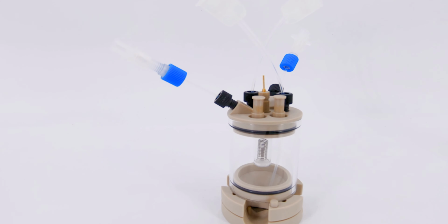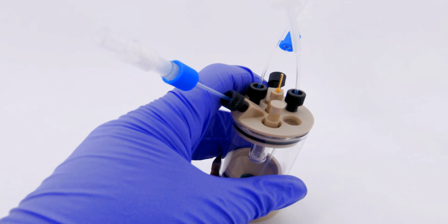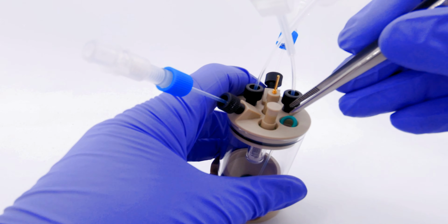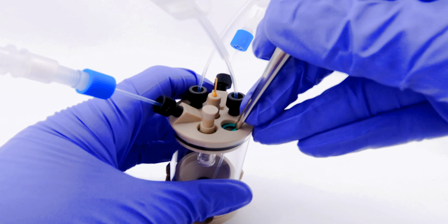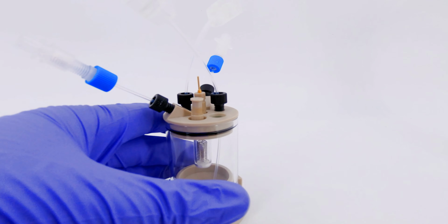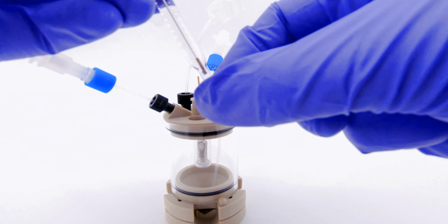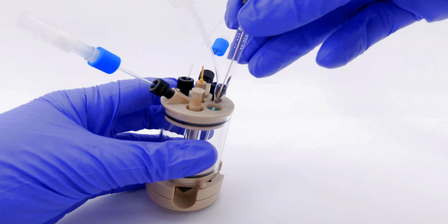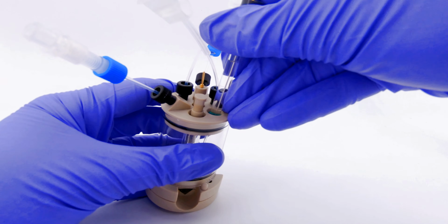For the reference electrode, remove one of the plugs and insert an O-ring with the help of your tweezers. Ensure the O-ring settles into the inset. Now, uncap the electrode and give it a gentle tap to remove any trapped air bubbles. With care, twist and insert the electrode into the cell.